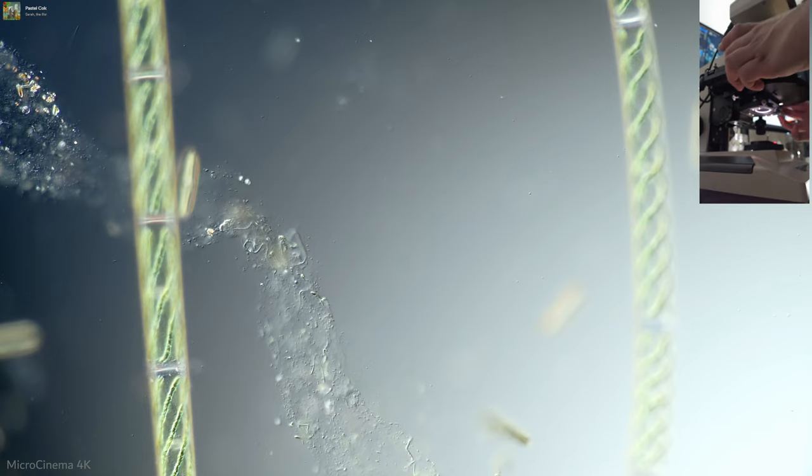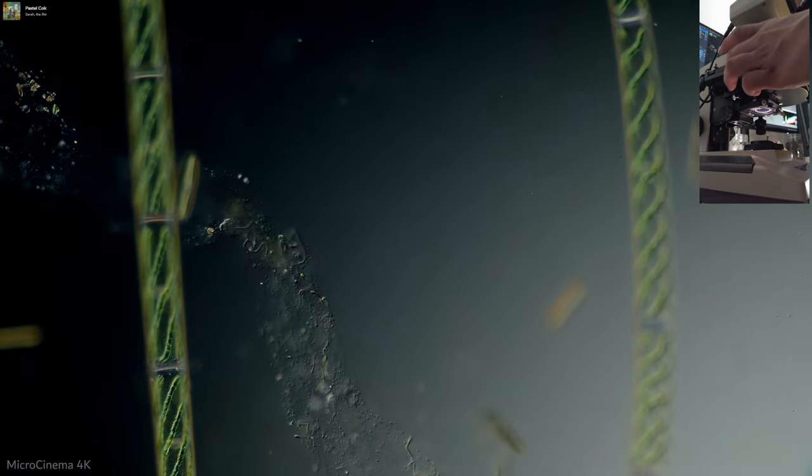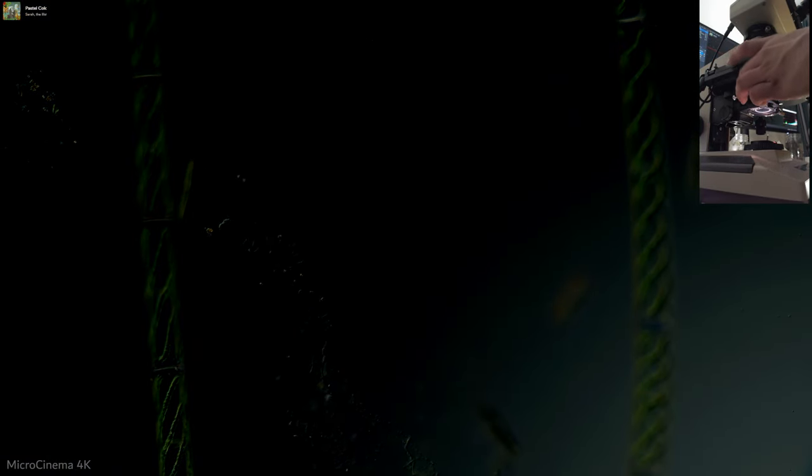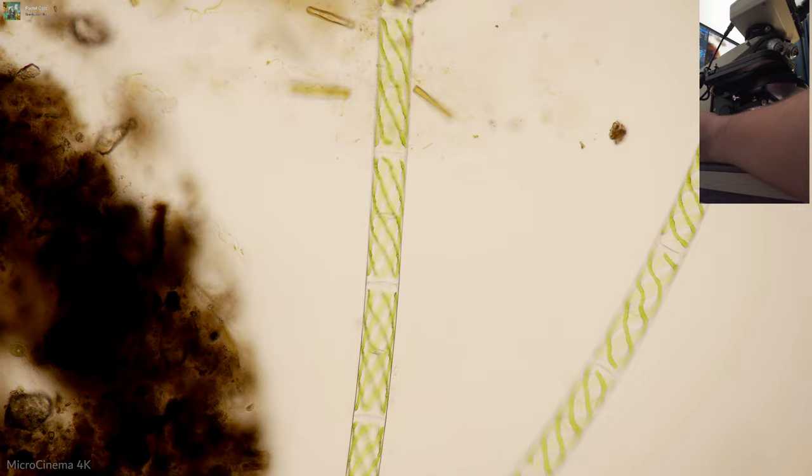Okay, go back to... we'll go back to Brightfield to finish things off. Switch back to the Brightfield position on the condenser. We're already in the right position with the polarizer. Just need to pull the analyzer out and bring our iris down a little bit to get to Brightfield.